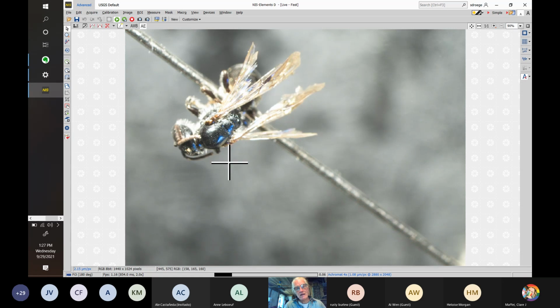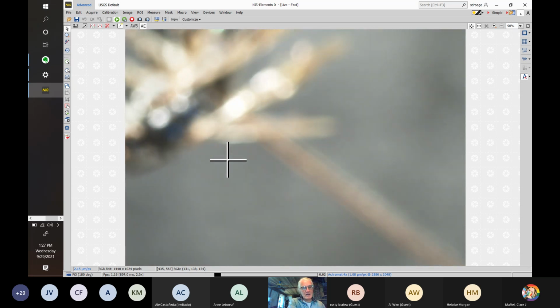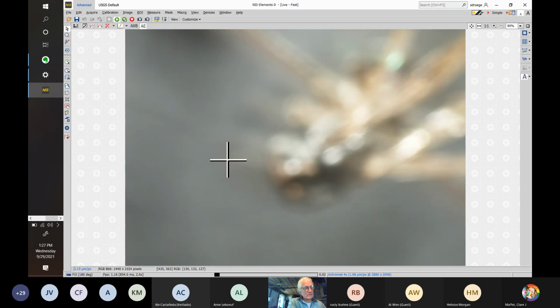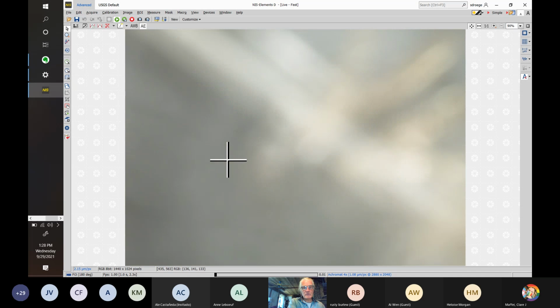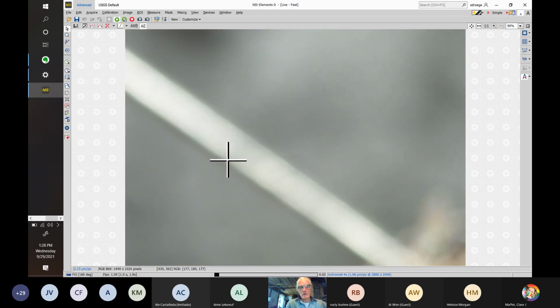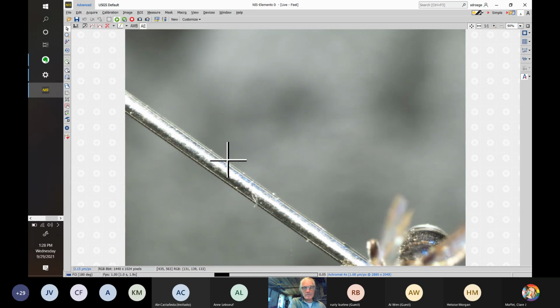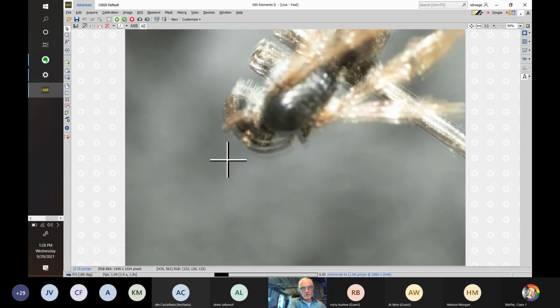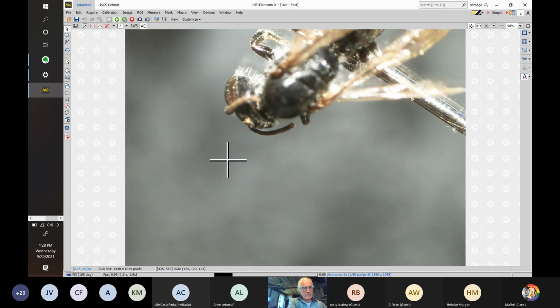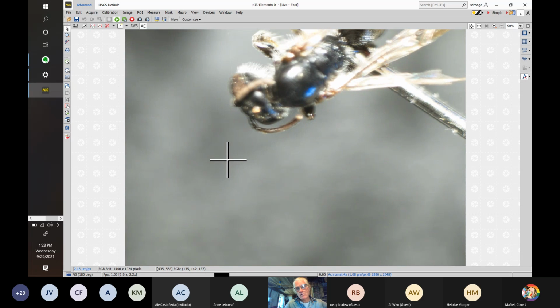So here is, well, let's zoom in. Here is the scutum and scutellum area and the bee, and I'm going to flatten this a little bit more so it is at as right an angle as possible with the camera angle. Okay, that's pretty good.